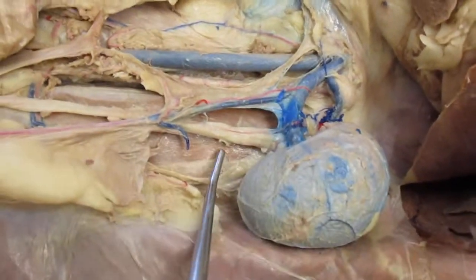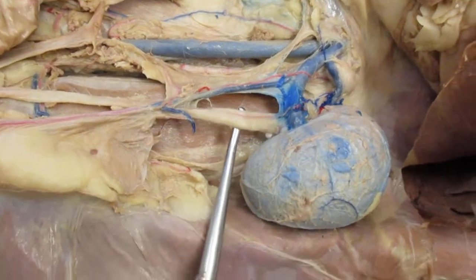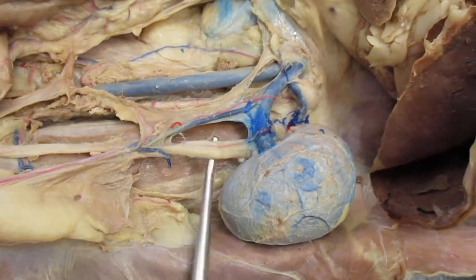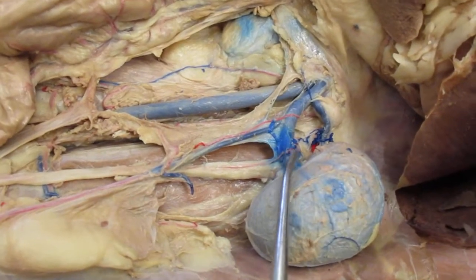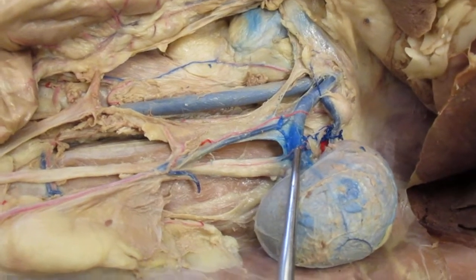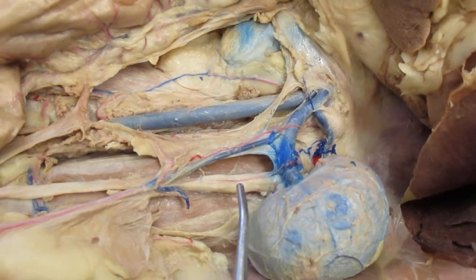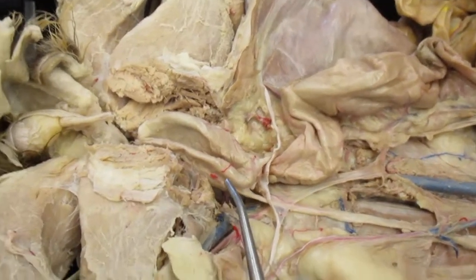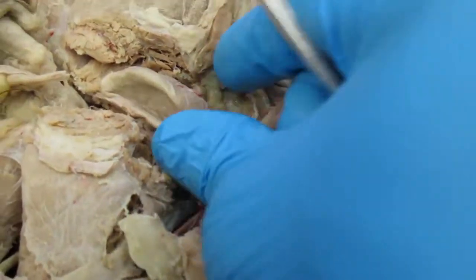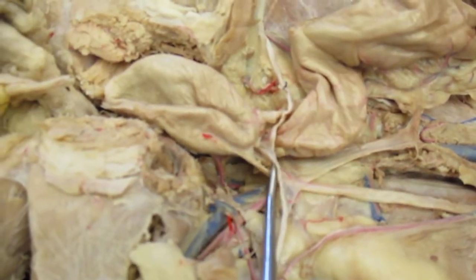Now, another structure I'll show you is the ureter. So you can see the ureter here, kidney, renal vein. The ureter is going to be going down through here, and it's going to then connect to the bladder, the urinary bladder, like we see here.